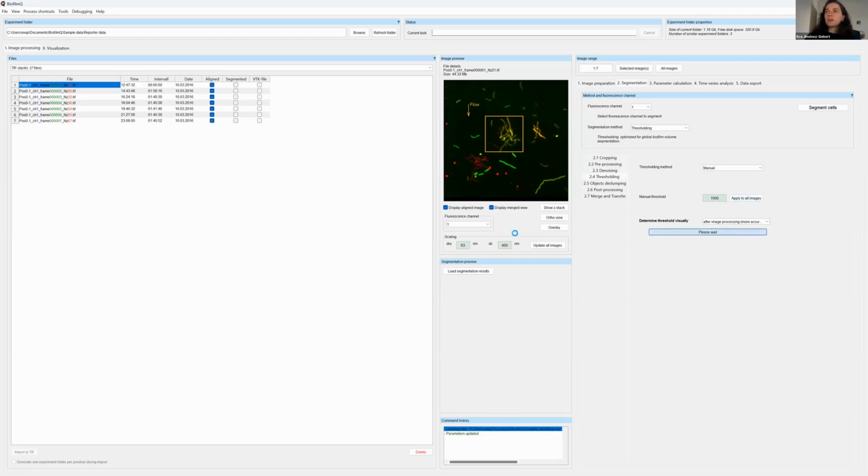And you can get visual feedback on how this looks by clicking on this button. When you click on this button, you should get a preview of what you are doing with the filters that you're applying and with the threshold that you're applying. And you can choose two different options here. You can choose to get the preview without the filters that you're applying in the previous section, or with the filters. What I just clicked is with the filters, and that is right now awakening my parallel pool. So that's why it's taking a moment.